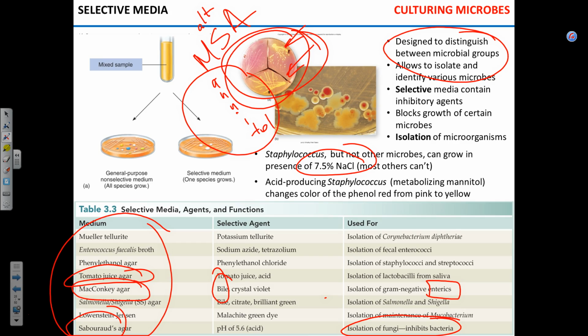That makes sense? So if you compare the size of bacterial colonies on Sabouraud after the same amount of time, they will be tiny, tiny, tiny little colonies, and will be full size on the regular TSA plate. Does that make sense? Inhibition doesn't mean completely prohibiting. It means very much slowing down. Right? Any sense on this? Any questions on the selective?